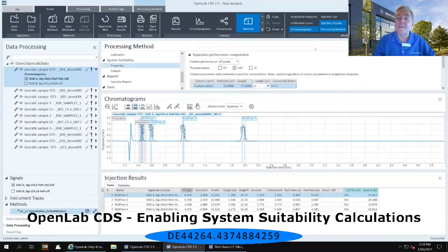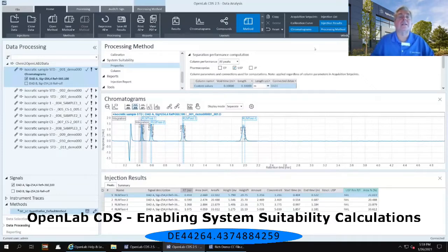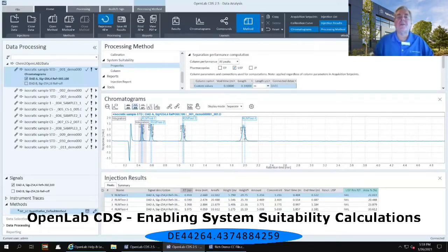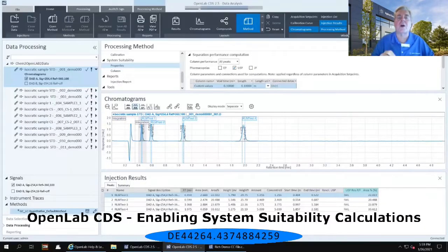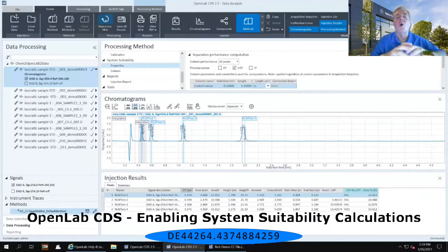Now with this information filled out and system suitability properties activated for this method, select Reprocess All again in the upper ribbon. It's very important that you use Reprocess All and not just try to process one injection at a time.